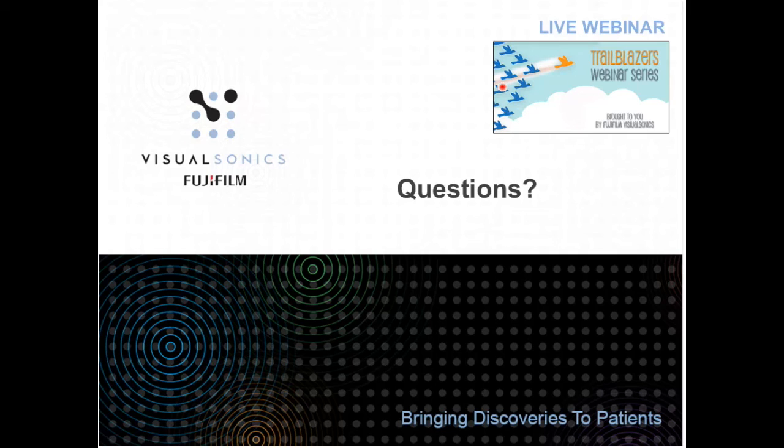Drew, here's one for you, a little more technical. This is kind of a tough question, but if you could speak to it: how does the spectral unmixing account for the changing spectra due to the fluence dependence? As you go deeper into tissue, obviously the fluence will be attenuated because of the tissue path. How have we dealt with that? Do we see it actually affecting any of our results with the spectral unmixing, or is it fairly robust to be independent of that attenuation?